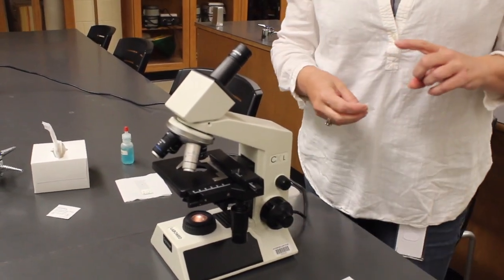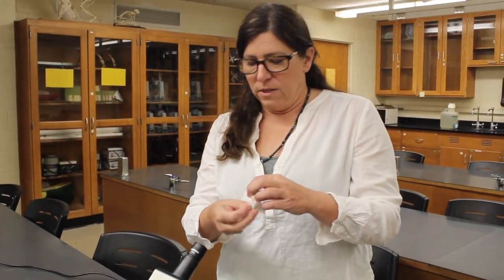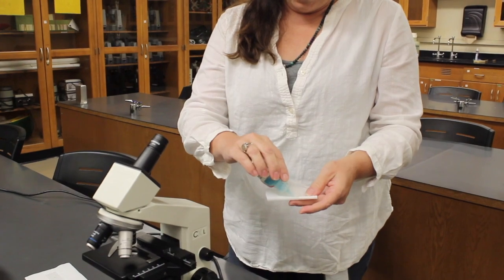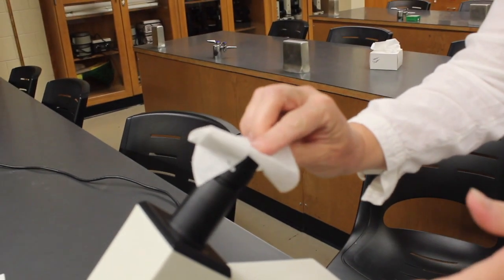You do not want to clean the lenses at this time. The lenses are going to be cleaned using a different liquid. You do not use alcohol on the lenses. So in order to clean the lenses, we're going to use a Kim wipe. It's a very gentle piece of paper and lens cleaning solution. Just take the lid off of there and put some of the solution on your Kim wipe. And then you're going to very gently, in a circular motion, clean the ocular lens.